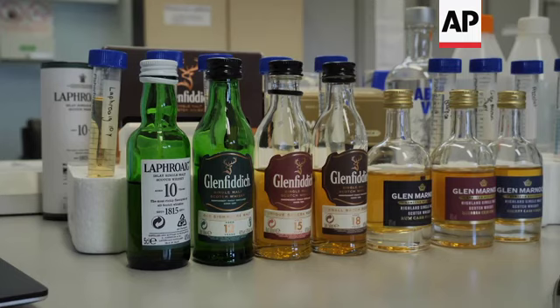There's a good deal of commercial potential for a device like this, whether it be on a production line for quality control in liquid mixtures like whiskies or juices, but also for looking at counterfeit products, counterfeit whiskey being a big problem. This tongue would be able to tell you in a very definitive sense whether it was cheap whiskey manufactured elsewhere that was posing as an expensive whiskey, or it was the article itself.